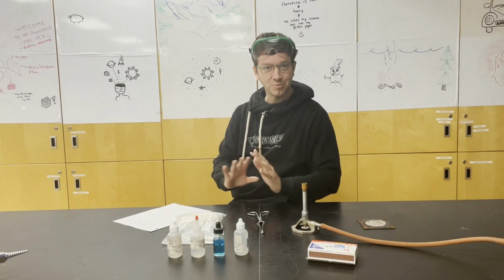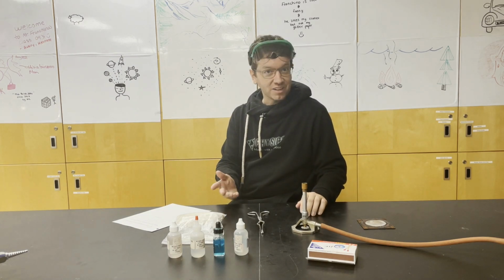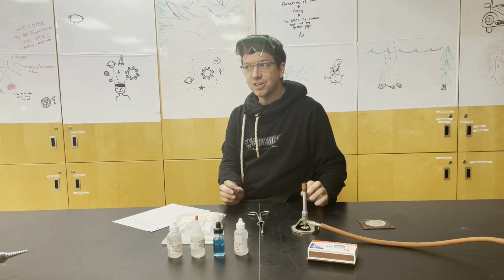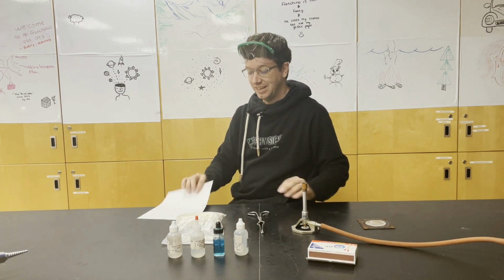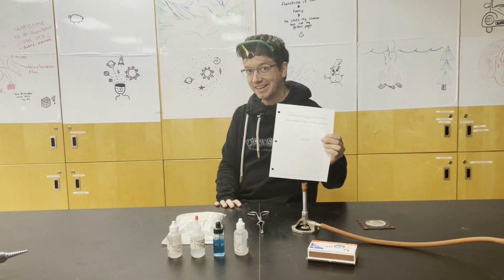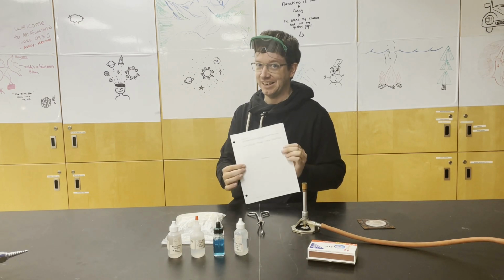In this video, I am going to demonstrate a lab that I do with my grade 12 chemistry students, where we analyze the different colors of flames and then look at the energy of those photons that will be released. There's a simple chart. This is the lab handout I give my students. If you want a copy of it, you can download it for free in the handouts.